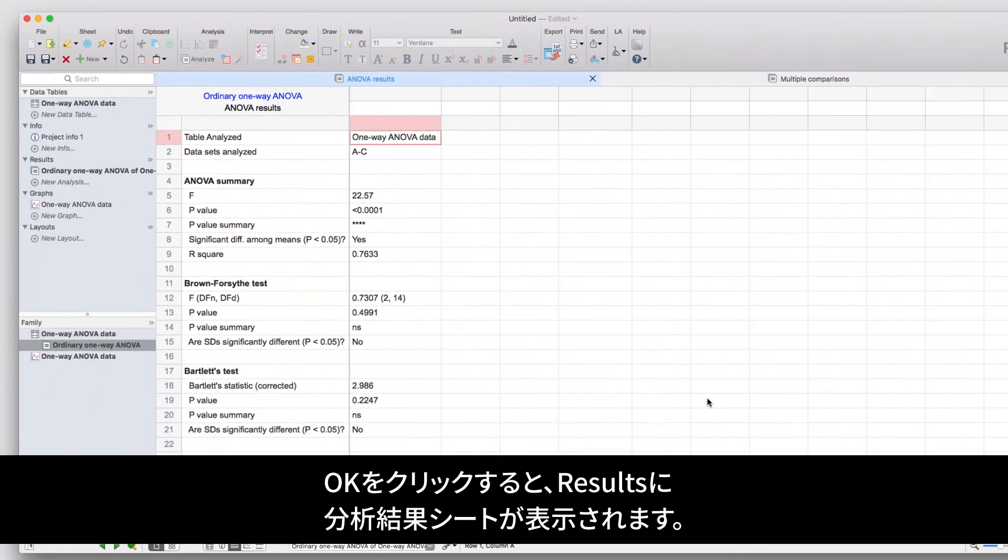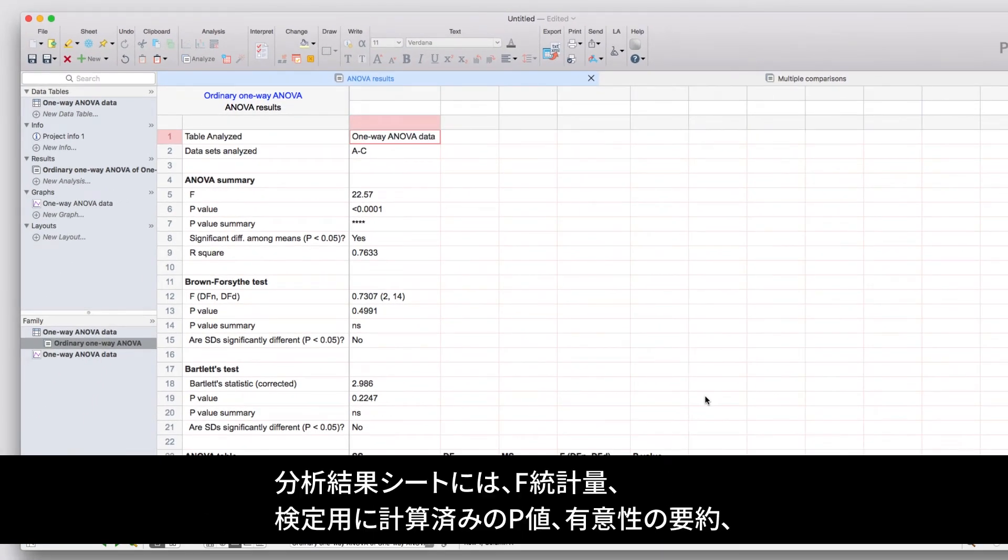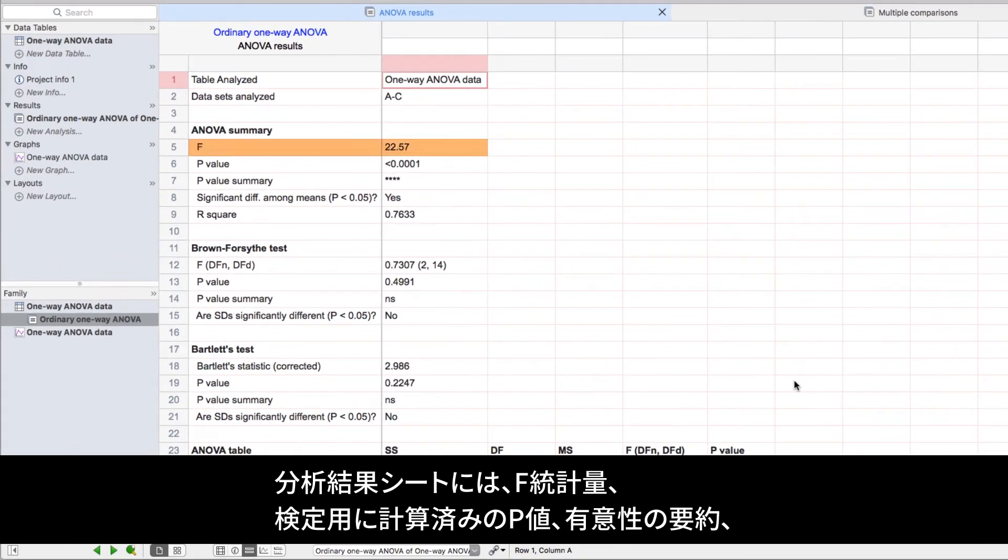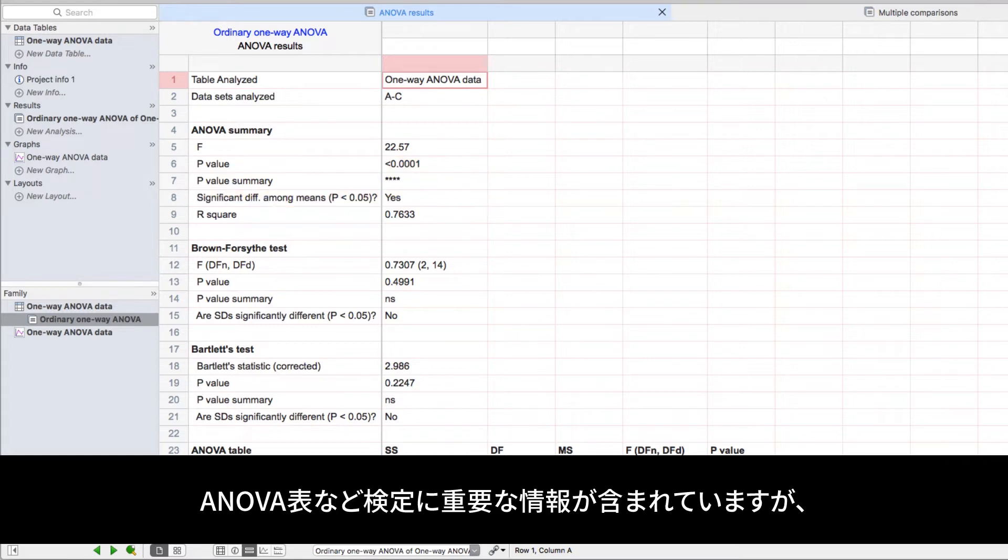When we click OK, we'll be taken to the main analysis results sheet. Within these results, you can find important information such as the F-statistic, the calculated p-value for the test, a summary of significance, and other important information for the test such as the ANOVA table.